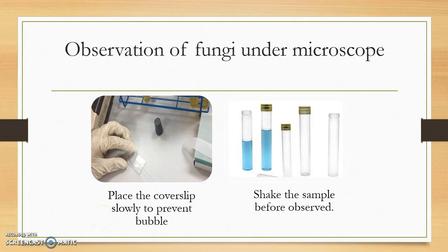As for the conclusion, we can conclude that we learned a lot of things during this class. We learned how to isolate the anaerobic fungi using conventional methods. So I think that's all from us.